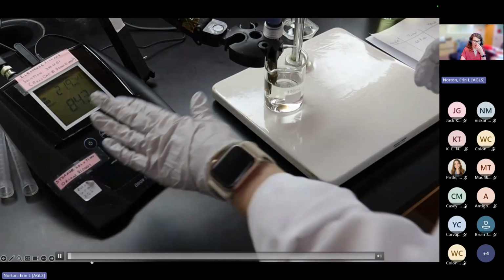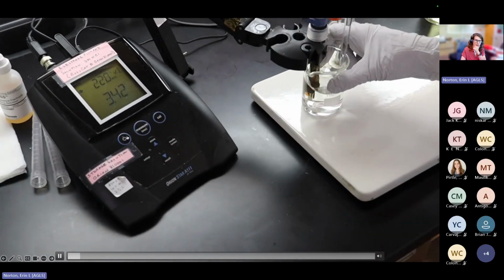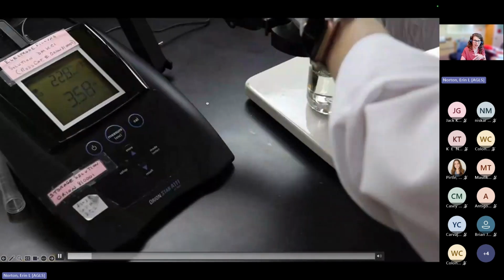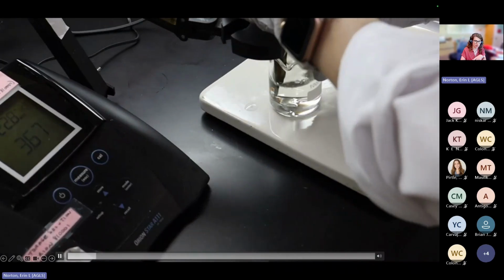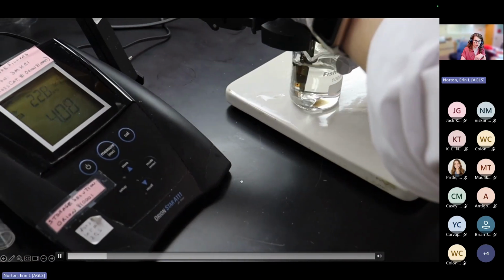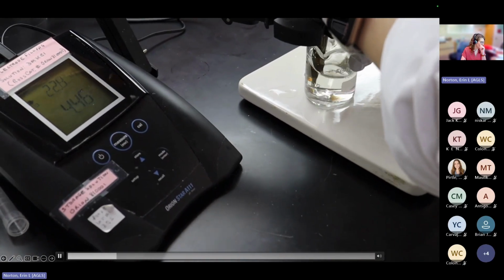And I'll probably talk over this video a little bit. We want to make sure that the pH meter is going during the entire analysis. I am manually swirling. Don't get spillage like I did. We're manually swirling the beaker. A slightly larger beaker would be good.